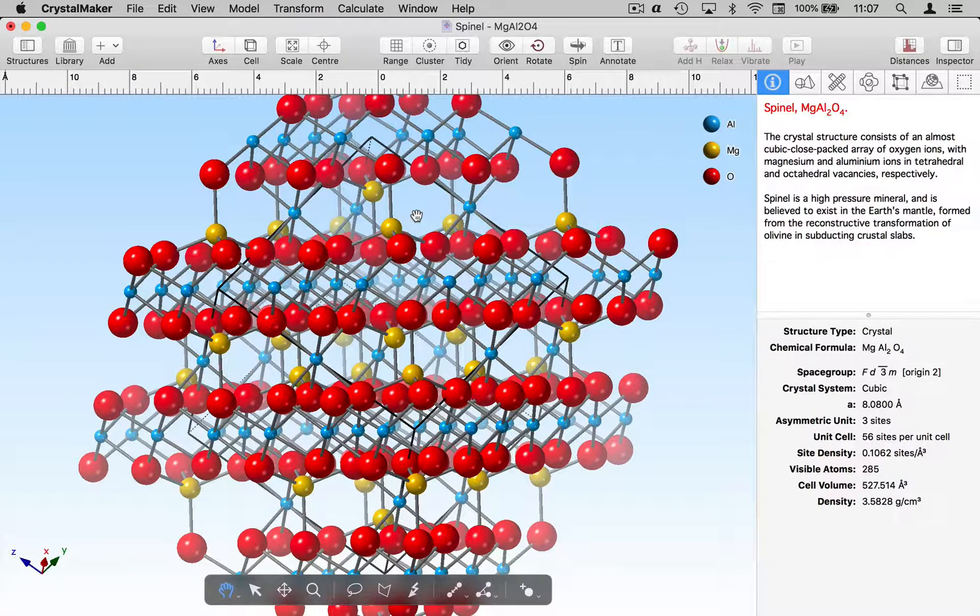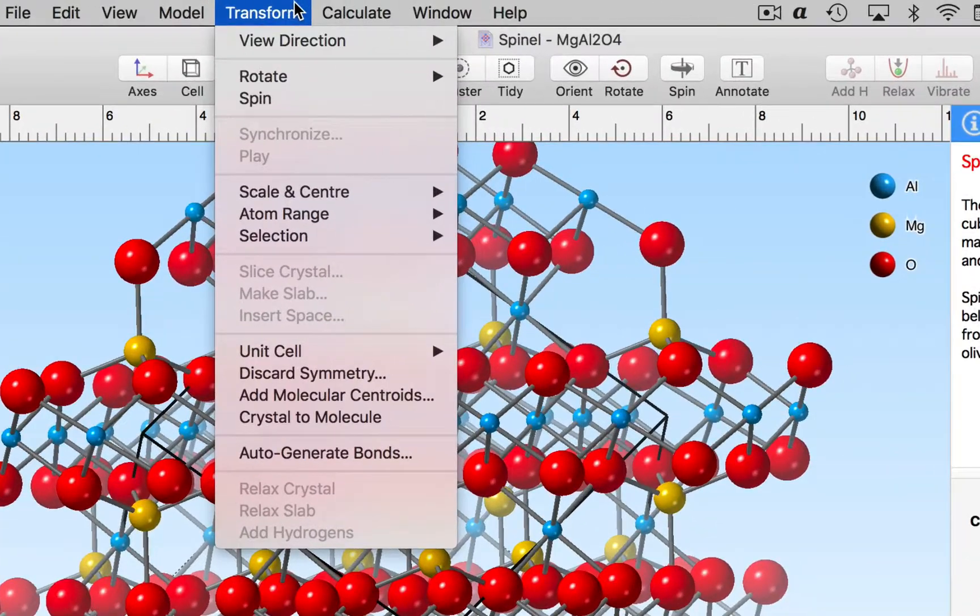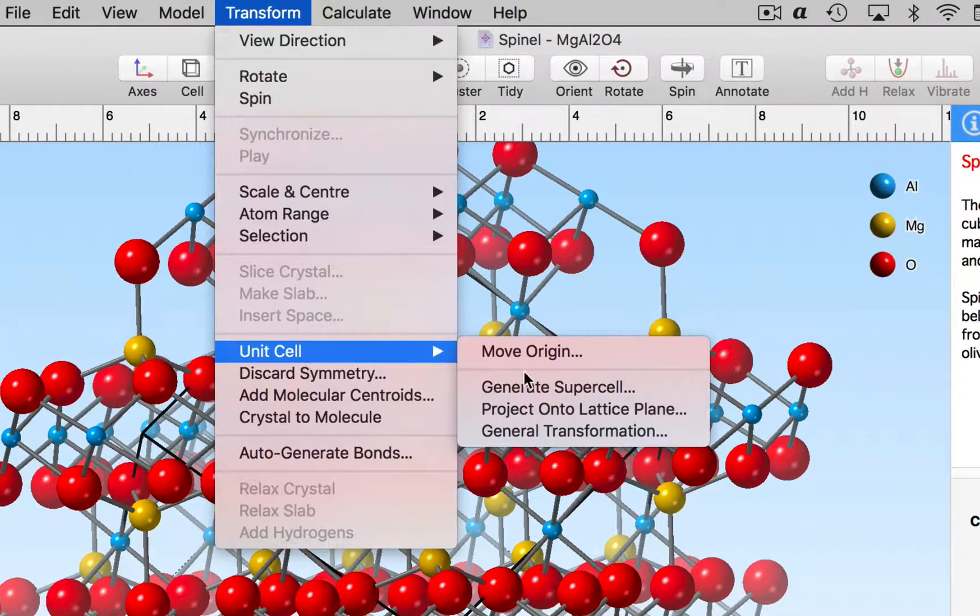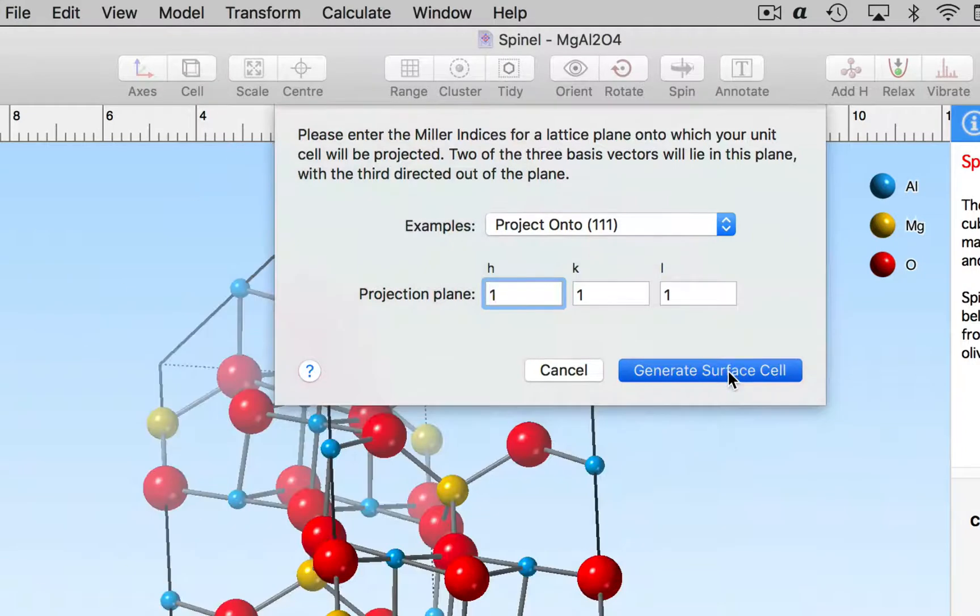Now the first thing I want to do is transform this unit cell from a cube shape to a surface cell where two of the three axes are parallel to those close-packed planes. So I'm going to go up to the transform menu, transform my unit cell and project it onto the 1 1 1 lattice plane. That's going to generate a so-called surface cell.